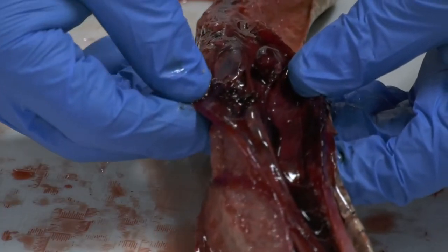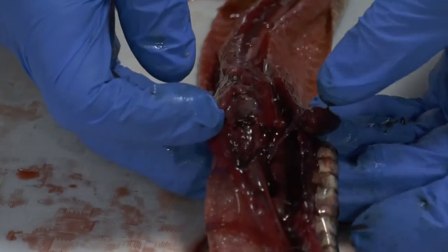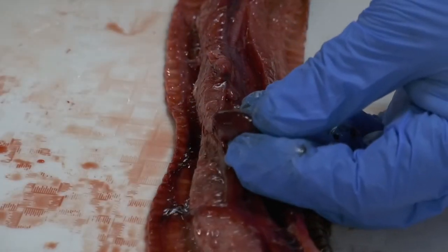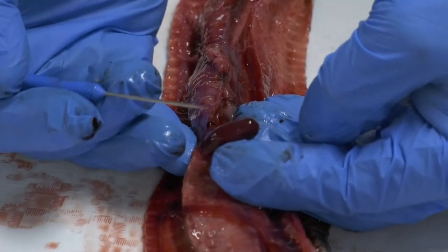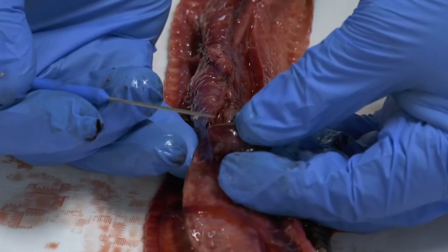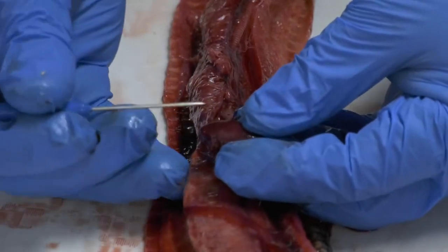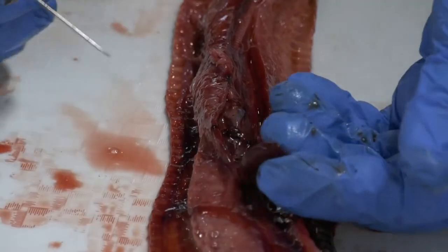All right, so what are we looking at here, Mr. Lance? So here we have the heart. Snakes, like other reptiles, have a three-chambered heart. That's different from our four-chambered heart. They have paired atria, I believe, and a single ventricle. I can't make out much anatomy on this guy. Yeah, it doesn't really look like much.